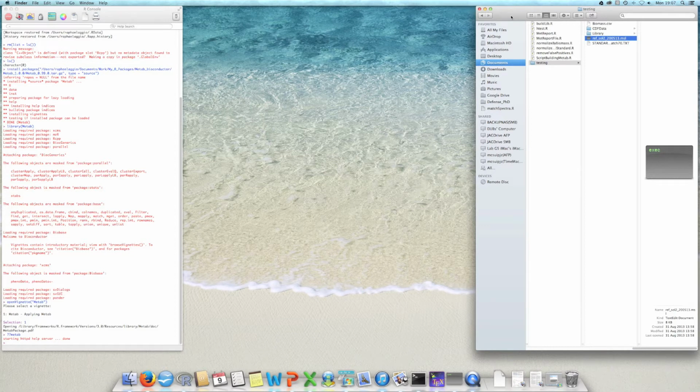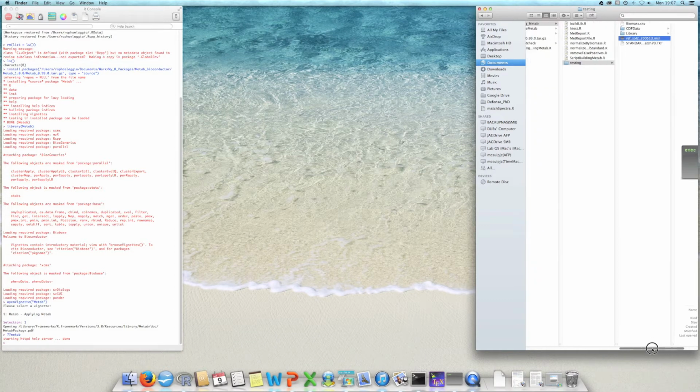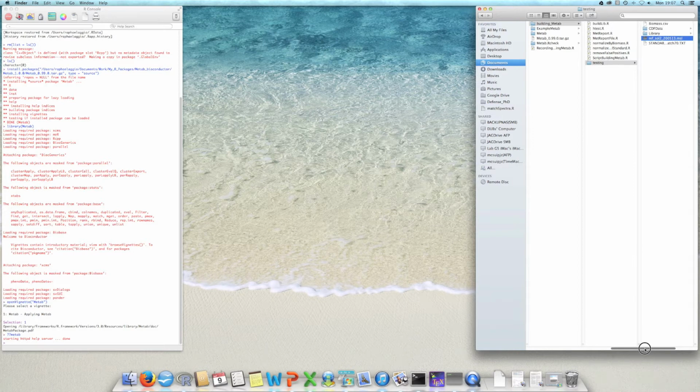It's very simple. After you did all this analysis in Amidis, we just need to organize our data in a way that Metab can automatically identify which sample belongs to which condition. So those are the samples we have. We have two experimental conditions in this case. One experimental condition is called 50 microliters, and the other experimental condition is called 100 microliters. Each one has 5 samples.